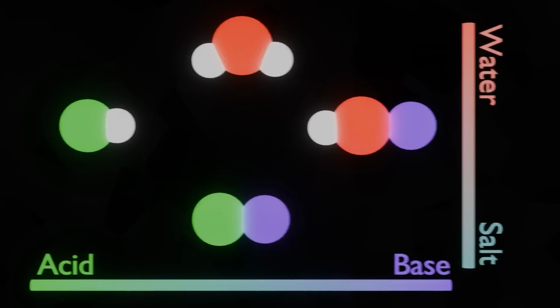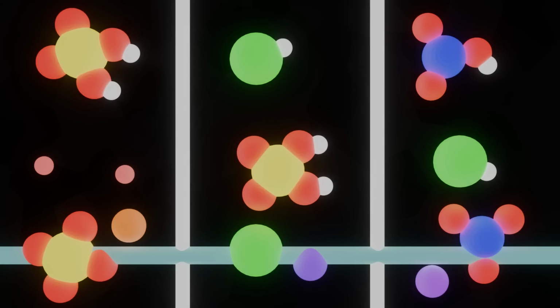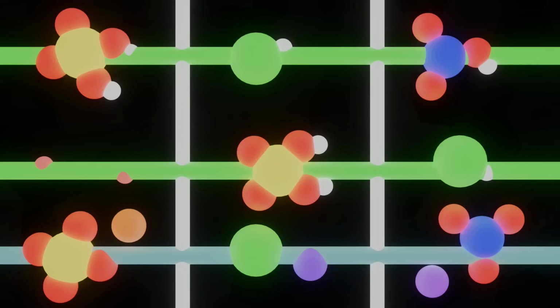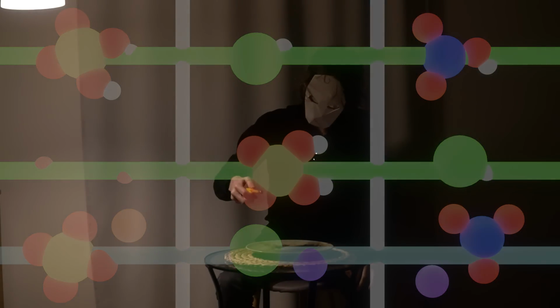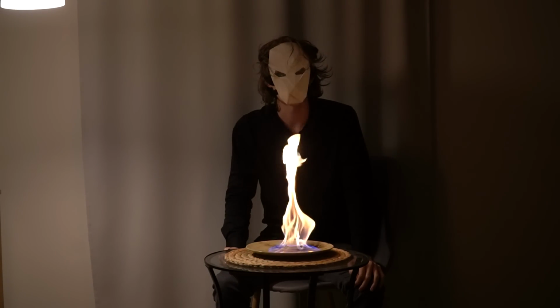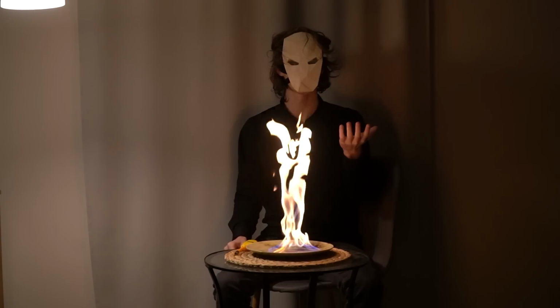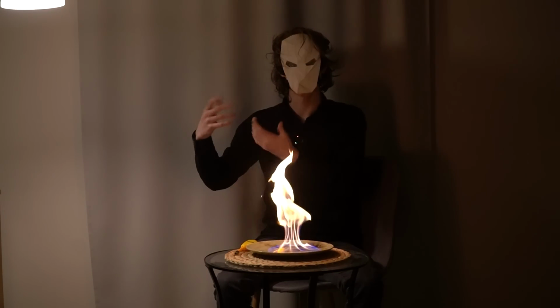Now, if you look back at all the reactions we've done today, you'll see that each time we took a salt, we added an acid, and we got back a different acid. Acid from an acid, from an acid, from an acid. This is actually really simple. It's a lot simpler than it seems, and that's because all you need to do is just take a salt, add in an acid, separate the new acid, and repeat.